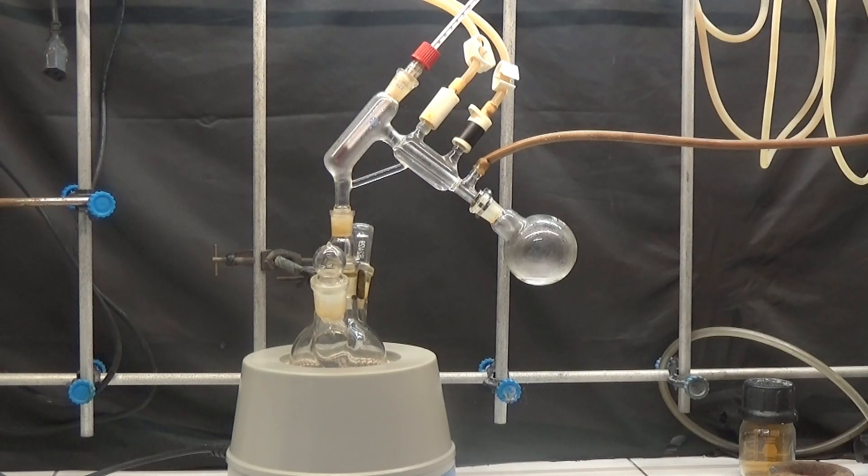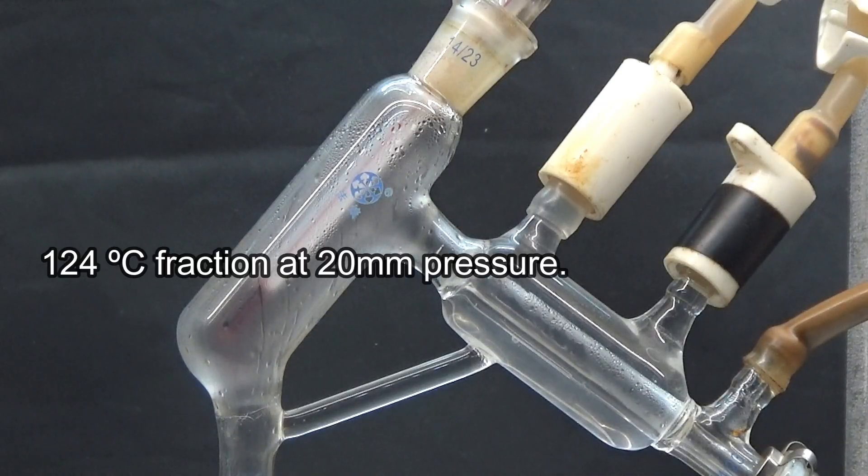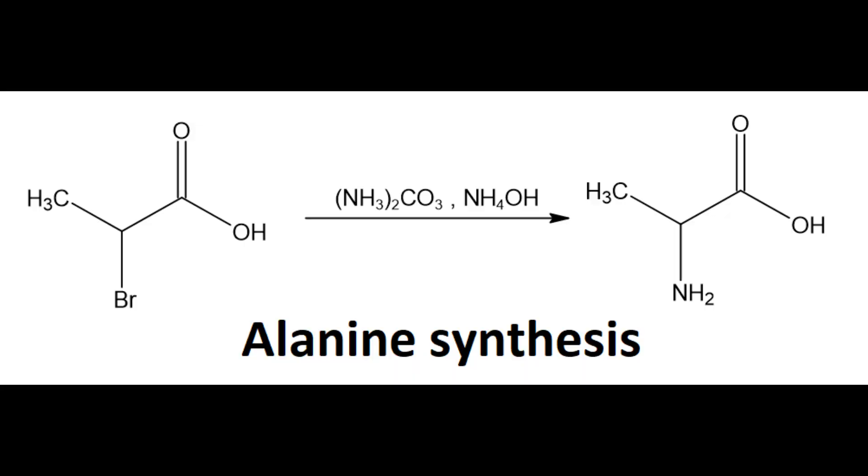2-bromopropionic acid can be distilled under vacuum by collecting the 124 degree fraction at 20 millimeters pressure. My purpose of this synthesis was to obtain 2-bromopropanoic acid for the preparation of alanine, for which this purity is already sufficient.